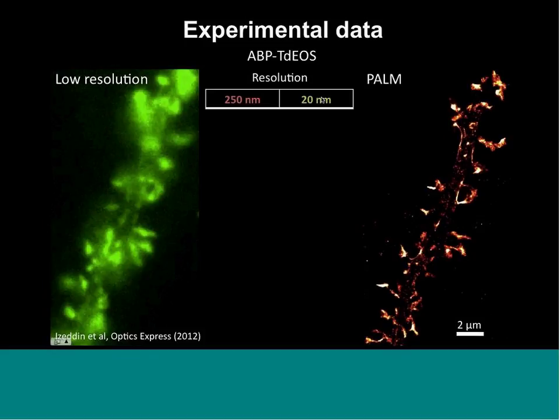So, okay, this microscope can have this improvement of 10 times better. So what's the trick? Of course, there is a price to pay, because you know that in microscopy there is always a trade-off.